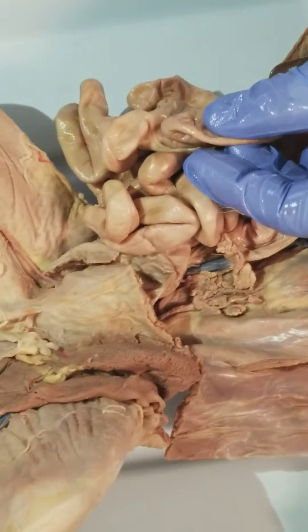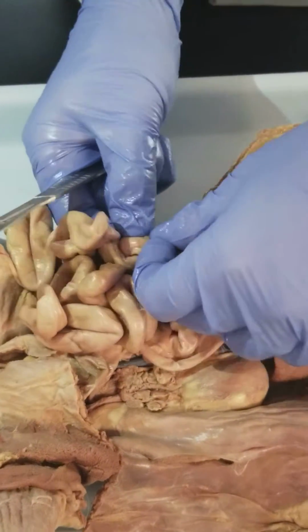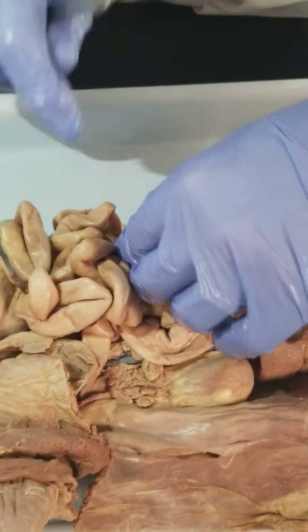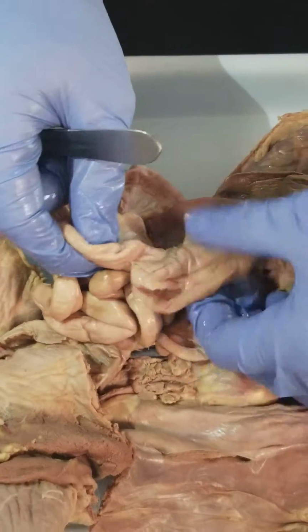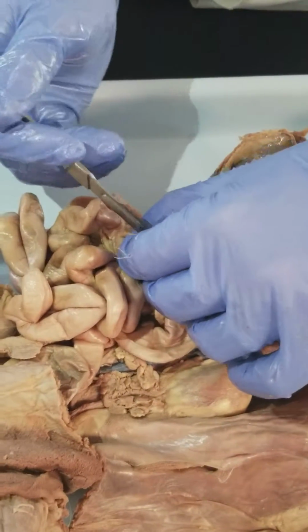And so one of the things that we want to try to do, just to show you guys what that ileocecal valve looks like, is open this up, if I did it correctly. It's juicy. A little bit.